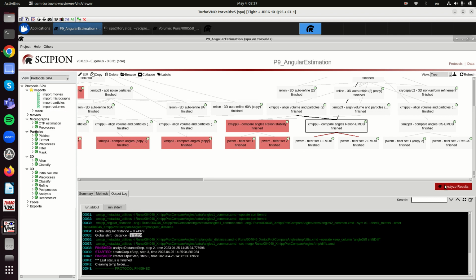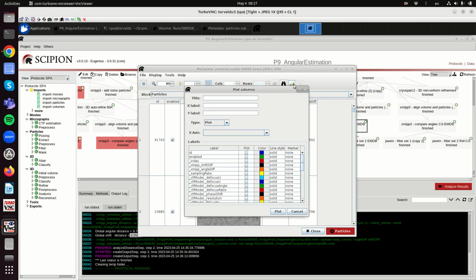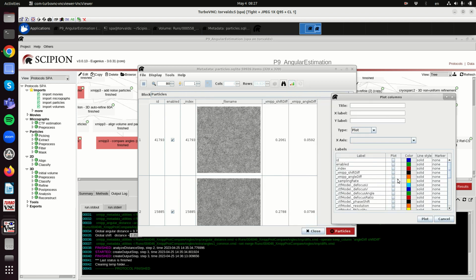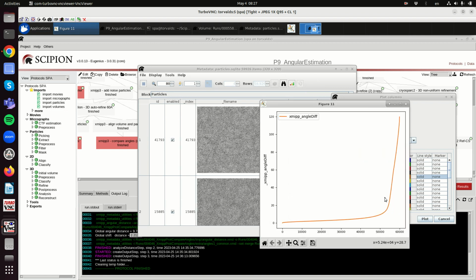So this is again another message. It is not enough to say I have computed this with Relion. The angular assignment and all the analysis and all the results depend on how you have used Relion, which parameters you have used, and that is why it is so important to disclose everything that you have done. So if you run Relion twice, you get a much better stability than if you compare Relion to whatever was done before.